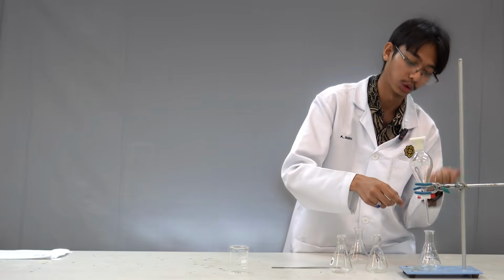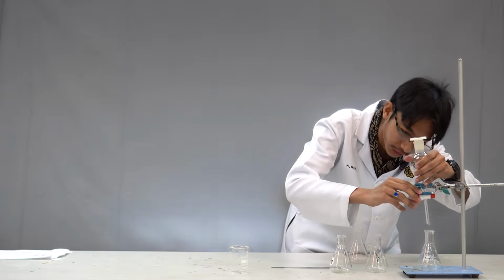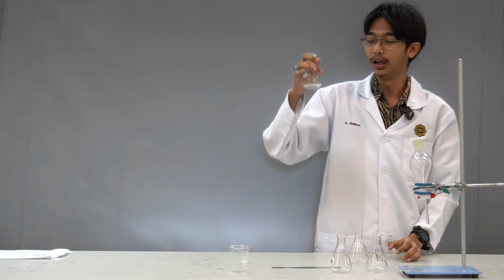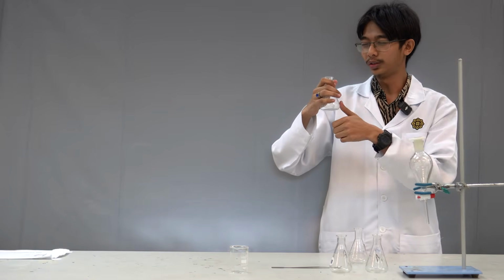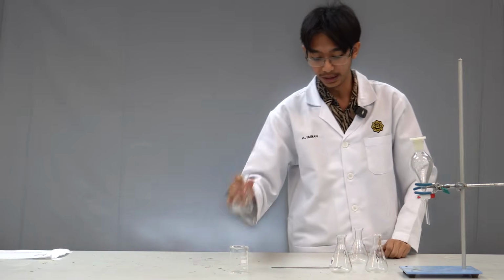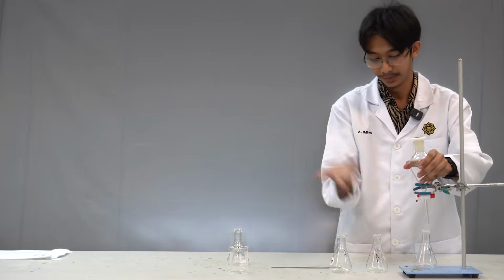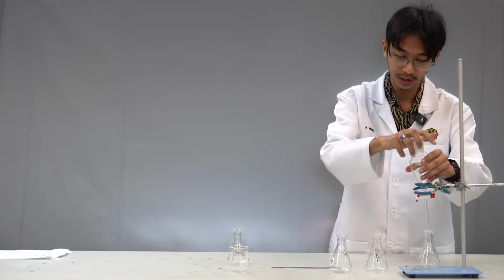So anyhow, what was I talking about? Yes, basically you do it like how you do your titration, make sure that you get everything out, and then this is going to be your mixture. This mixture is going to contain neutral substance, basic substance, and your DCM in the start. So basically, what you left here is going to be your acid. So when you have your acid, you can just open the funnel and just empty it out, just empty it out as such.